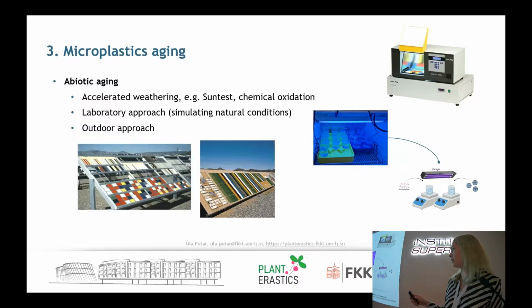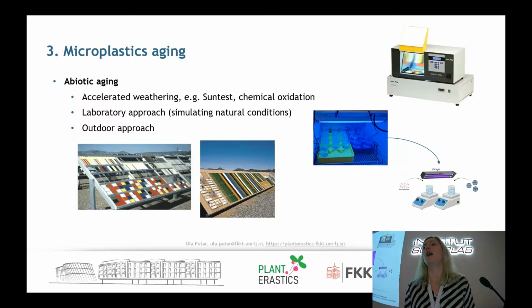And then we did some additional experiments. One possibility is also an outdoor approach. These are not microplastics, they are tiles, but still I know from reading a lot of papers about aging that some researchers also do an outdoor approach to aging, so just putting some particles, for example, on the roof. But of course, there is always a chance that you will lose some particles during heavy rain, wind, and so on.